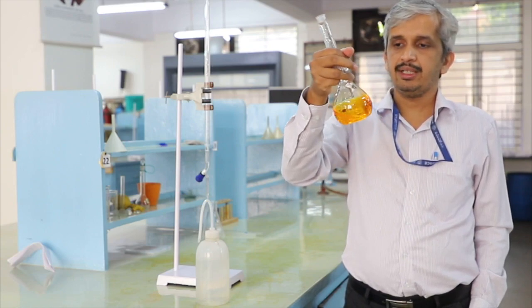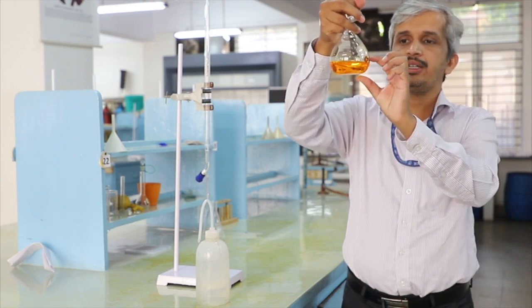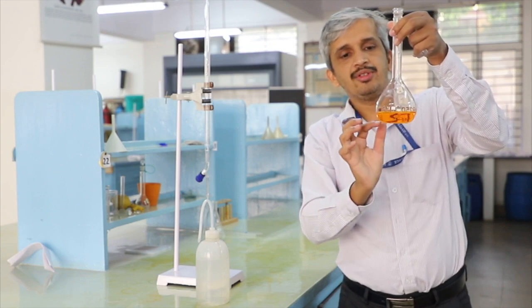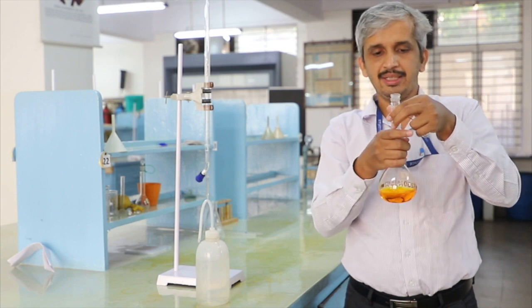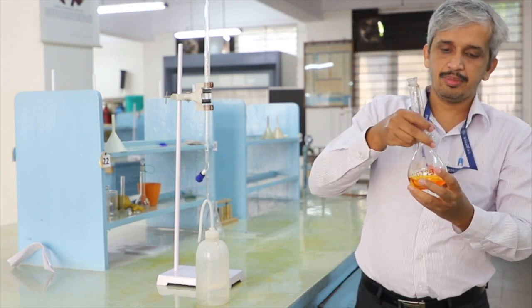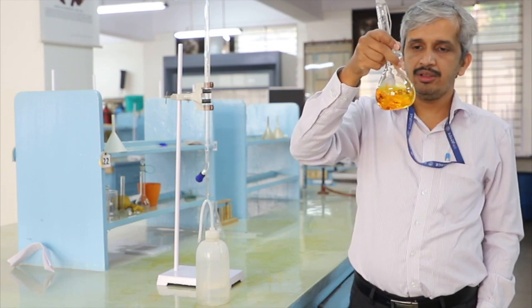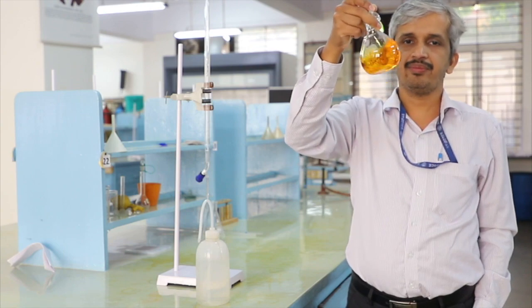I have added only approximately 30% of the water. I have not filled it completely, because if you fill this volumetric flask completely, mixing will not be possible, and the dissolution of solute will become difficult. Therefore, you should not add the full solvent now. The solute should be dissolved first.